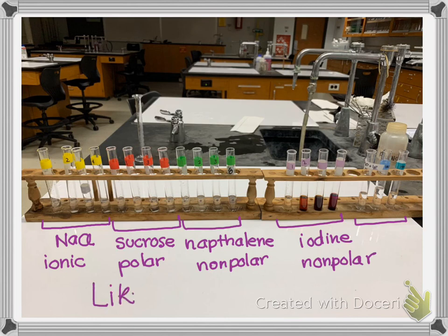And so as you go through this lab, I want you to try to process in your mind the idea of like dissolves like.